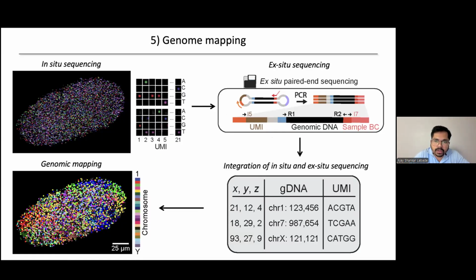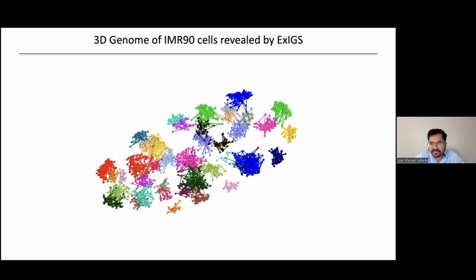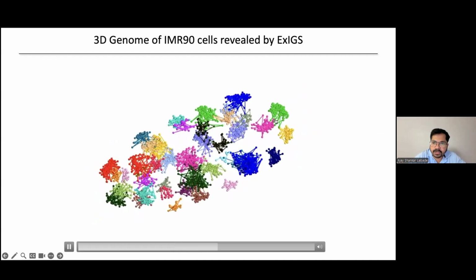Right. So now our task is to take all of these ROLNIs that you see here. They are colored according to chromosome. We have a chromosome clustering algorithm where we can filter out the reads that were not sequenced properly, or the fragments that have moved really away from the chromosome. This algorithm allows us to form chromosome structures, and this is how it looks after the sequencing and mapping is done. So you can clearly see the chromosome architecture and territories.